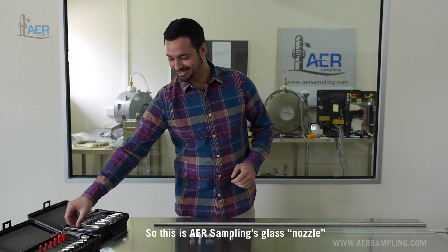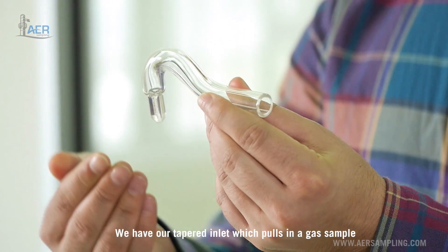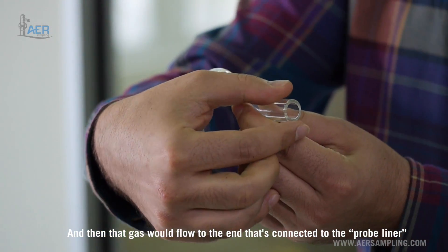This is AER sampling's glass nozzle. We have our tapered inlet which pulls in a gas sample, and then that gas will flow to the end that's connected to the probe liner.